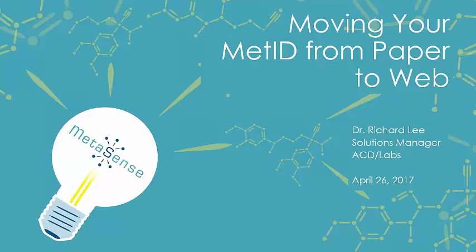Thank you, Doria, for that introduction. So as Doria has mentioned, today we'll be talking about how the MetaSense MetID solution can streamline your reporting practices. And I'll touch upon how it can go from your conventional paper report to the web.